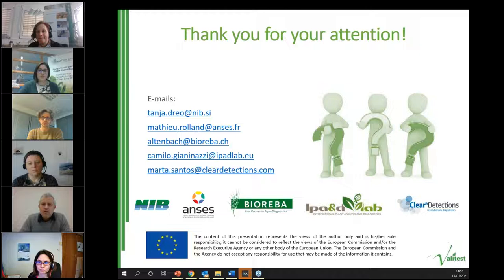Then from the moment that, as a manufacturer, we did the internal validation to the final use in ISO 17025, it was so long, I think, because we had to rethink and reorganize perhaps the different steps and the different actors, because as a provider it's always difficult, as I've shown in my presentation, to find a way to get validation data. We had the chance in 2013 to participate in a ring trial with our protocol, but that was chance, because we had the connection. And then there are normal times to have the mention in EPPO, for example, but then also the problem of accreditation bodies with different requirements at national level.